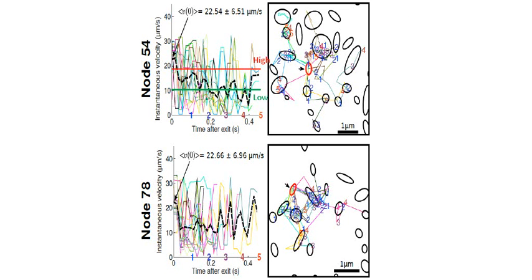Next, we wanted to study how the velocity evolves as a function of time along trajectories. So we started here, we looked at trajectories that are initially starting inside the red ellipse. This is in these two cases.